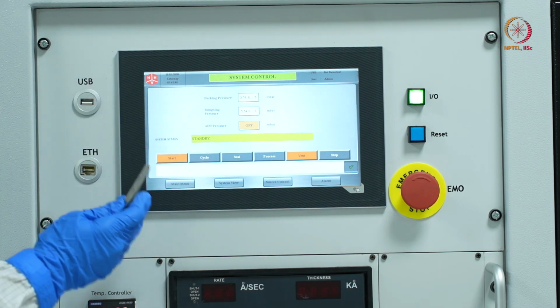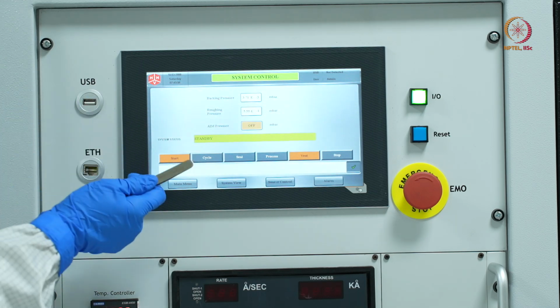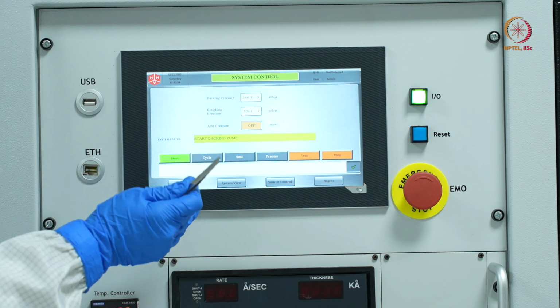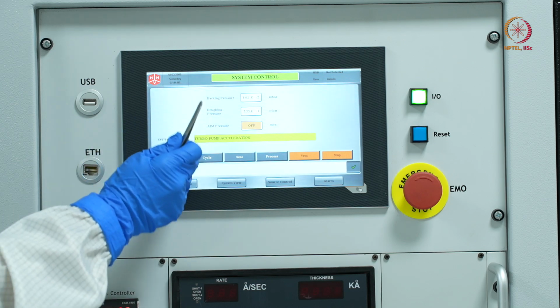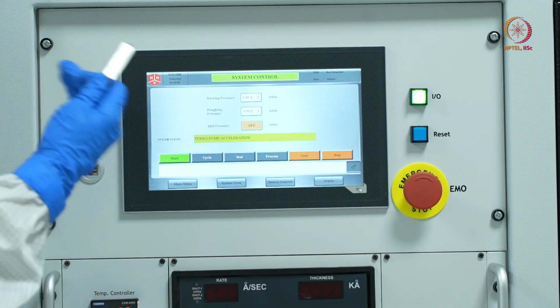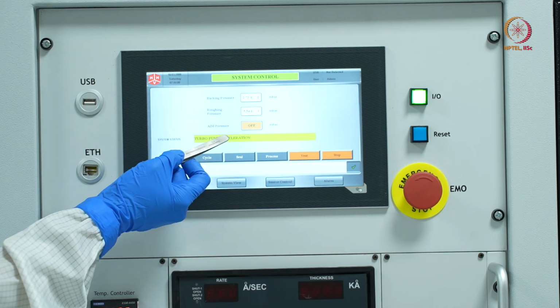To give that time to the turbo, I'll press start. This start doesn't mean that I have started evacuating my chamber. It is just a start for my turbo pump to start accelerating, and you can see the prompt that the turbo pump is accelerating.